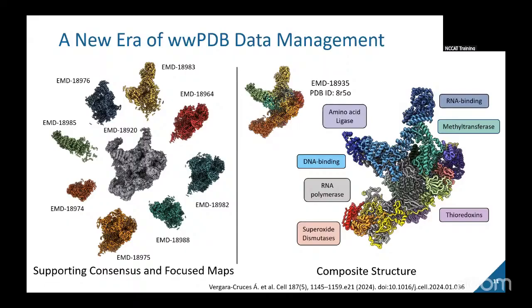And so, often what happens if you're not familiar with this strategy is that if you have a large structure and you're trying to analyze the whole thing at once, you'll have a map that has uneven quality. So rigid parts will show up very sharp. You can have then other areas that are poorly resolved due to flexibility or heterogeneity.